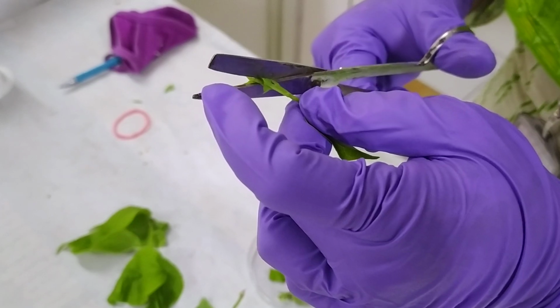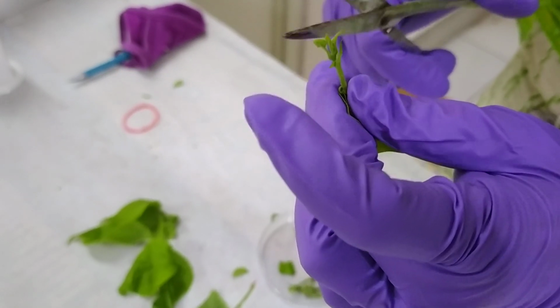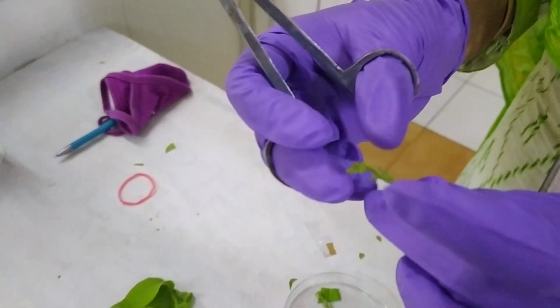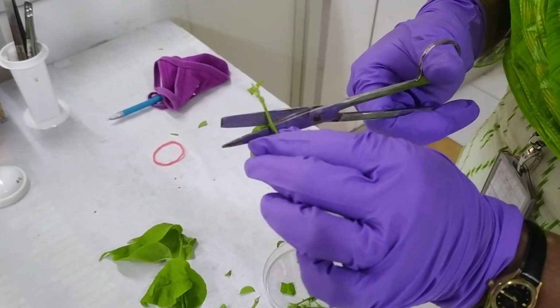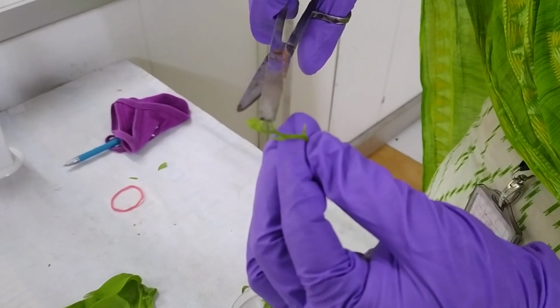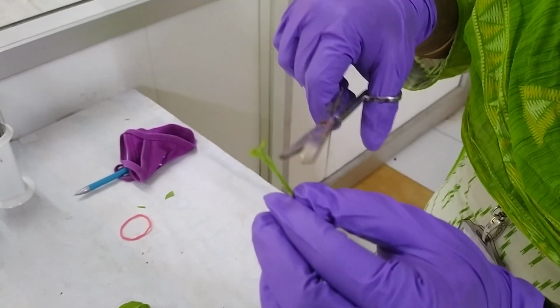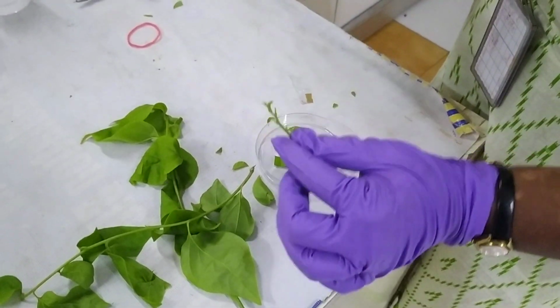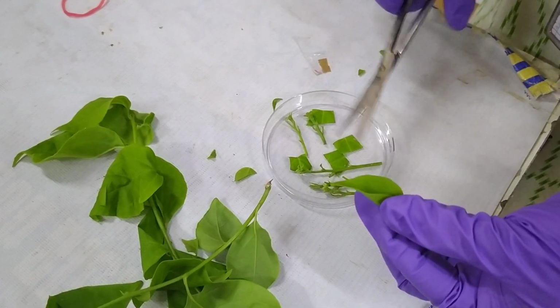Remove all the leaves. Ensure that you are not damaging the meristematic parts. Once this is done, the explant for your direct organogenesis is prepared. This part is the apical meristem, these are the intercalary meristems, and the surroundings will be the lateral meristem. This is for direct organogenesis, and the leaf bits I have taken are for indirect organogenesis.